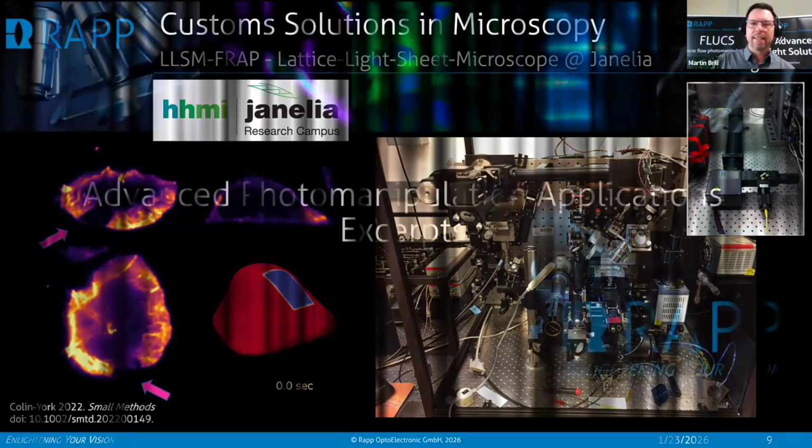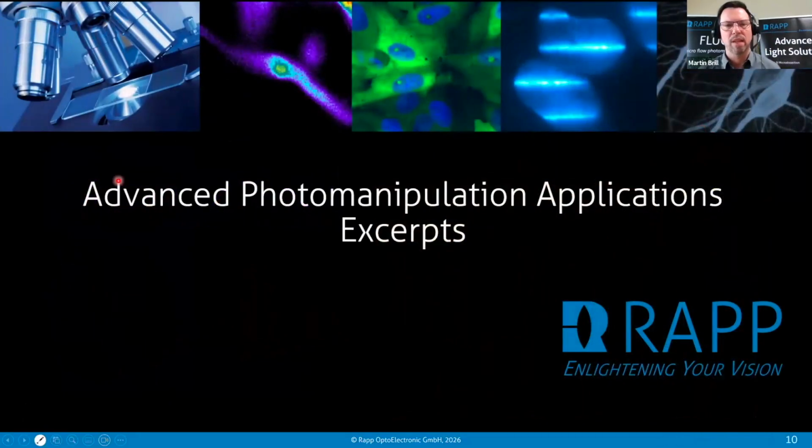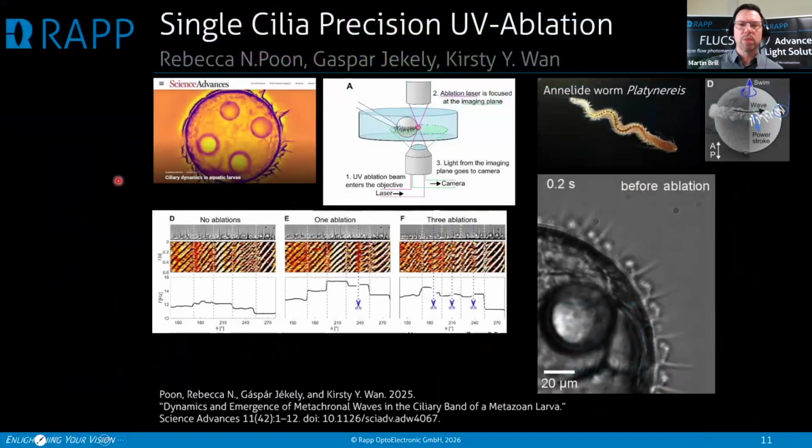All right, and enough from instrumentation. I also wanted to bring you some quite nice experiment examples, let's say, for advanced photomanipulation. And there's one beautiful study from Kirsty Wan from the University of Exeter in the UK. And they did something fun.